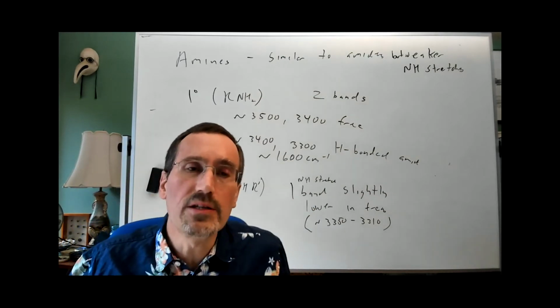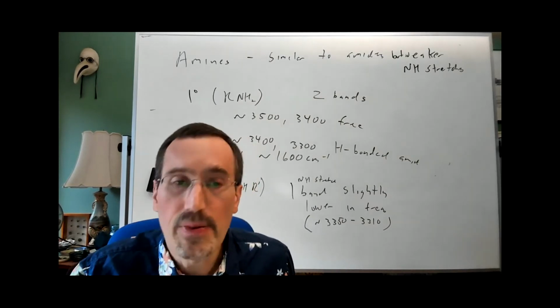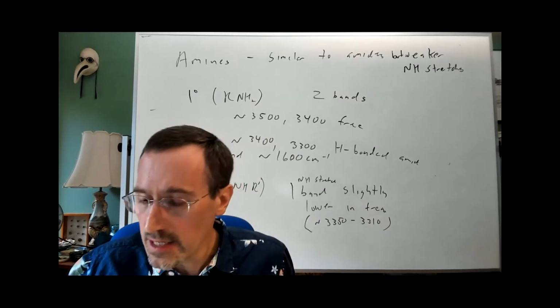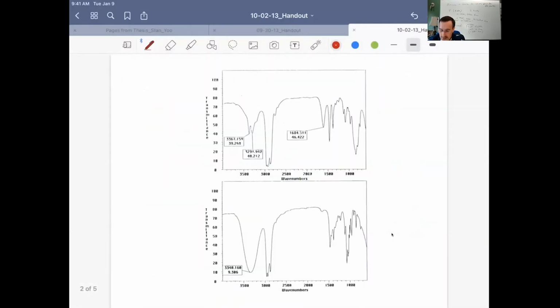So what I'd like to do again is to share my iPad screen and continue in our handout. And the reason I wanted to do this here is I think this is a nice example of a real amine. And I'll just tell you what each of these amines are. So this is butylamine.